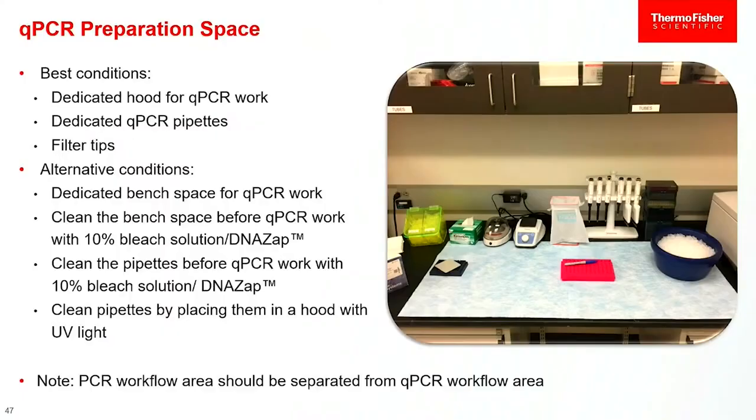Everybody uses them. Not everybody, but they're highly used. They're really good. Preparing your workspace, it's nice to be organized and set it up appropriately and, like cooking, collect all your supplies before you start, and your whole process is going to go better.